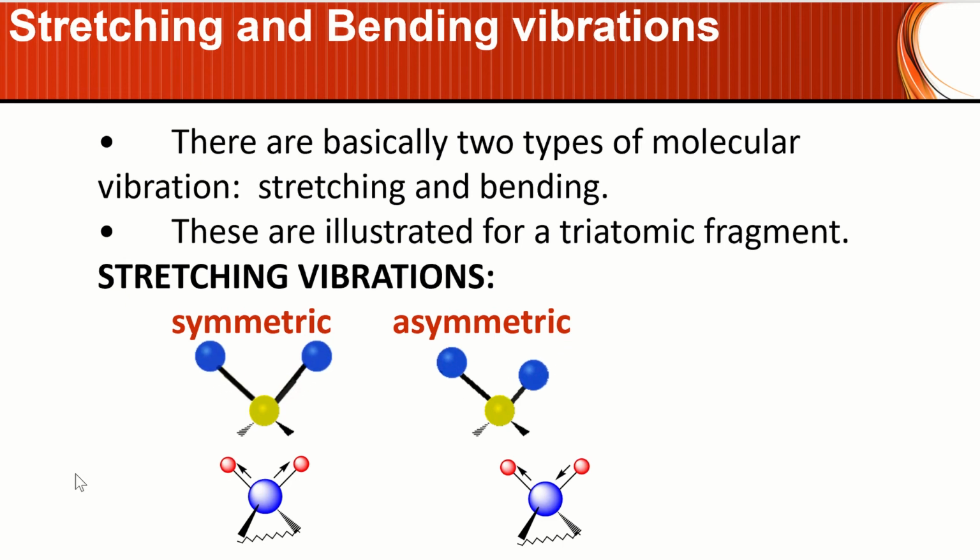So just to get you familiar with the animated version versus seeing it on plain paper. So this is our symmetric and asymmetric, and as the name suggests, it suggests the stretching vibration.